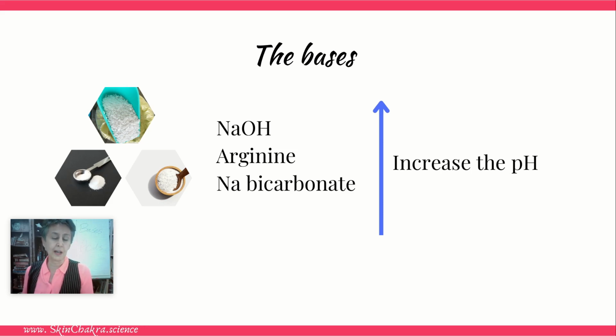Those ingredients either have additives or impurities that can affect the stability and performance of your product. Please purchase these ingredients from a chemical supplier. The price is much higher when you purchase them from a chemical supplier, but the purity is much higher. You have more control, and given that you don't need too much of these ingredients, the impact on the final price is not that much higher.